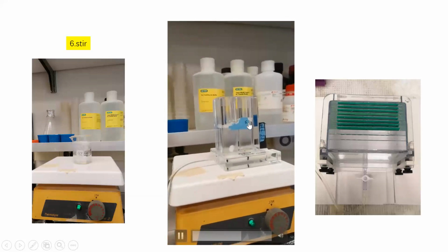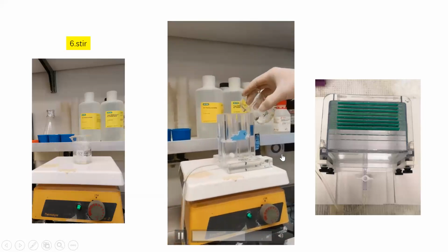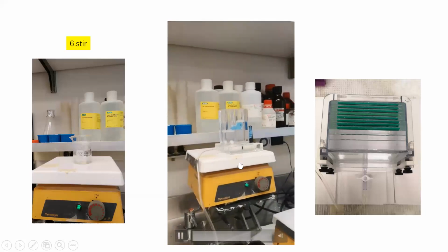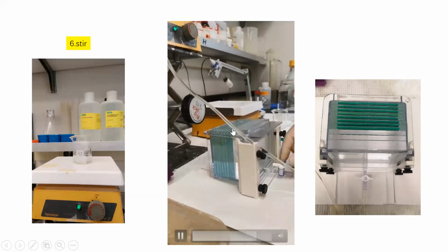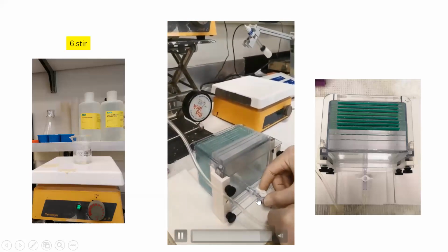After it goes down to 1/3, we will add the 20% buffer at last and mix it. At this time, you can see the buffer will go to the top of the chamber. At this time, we will close it.